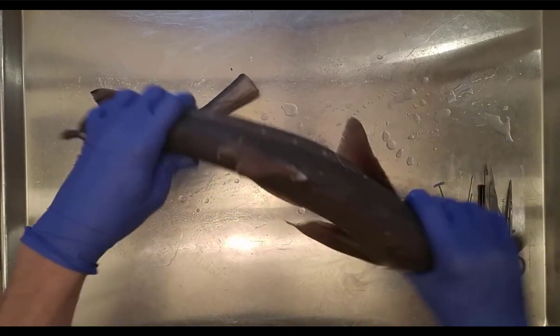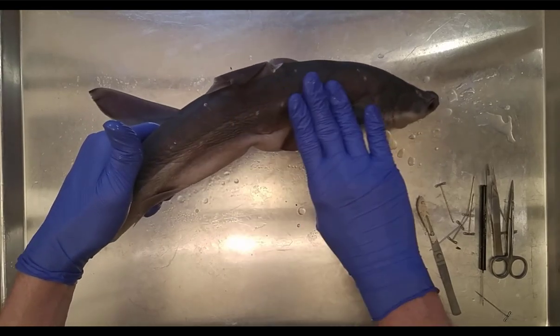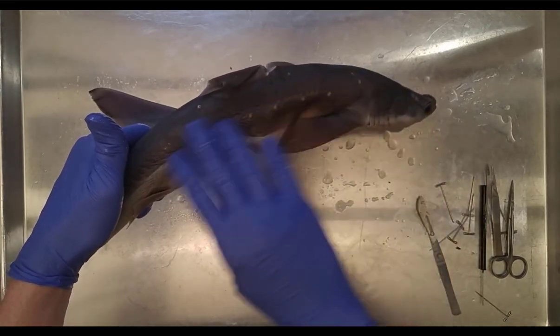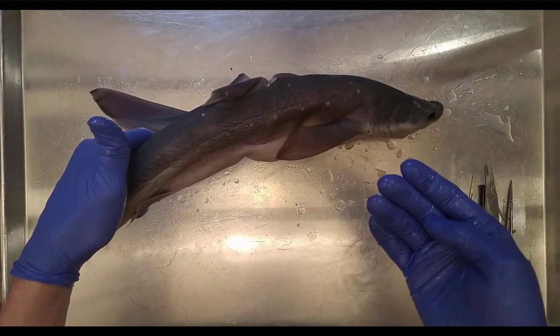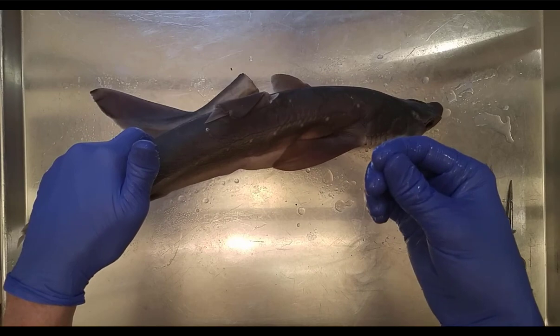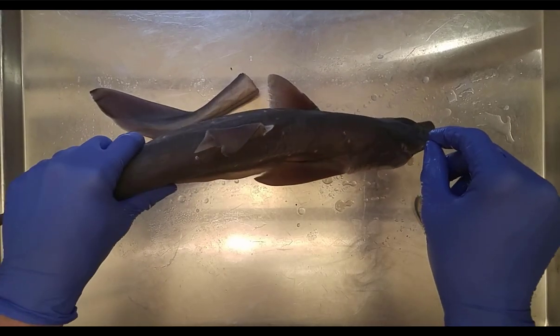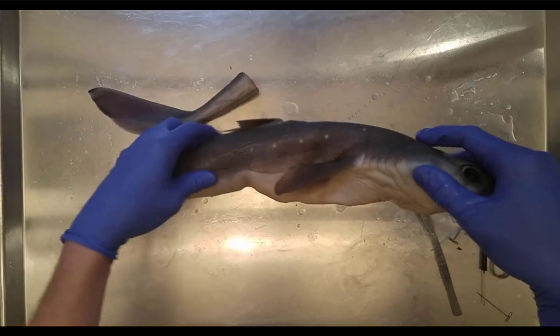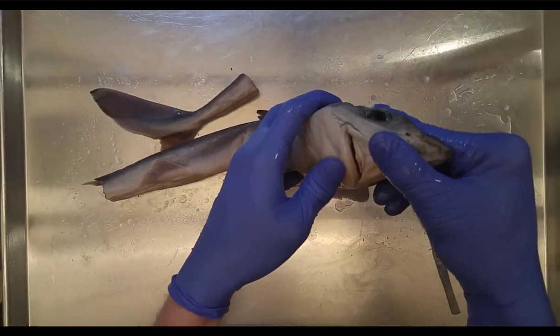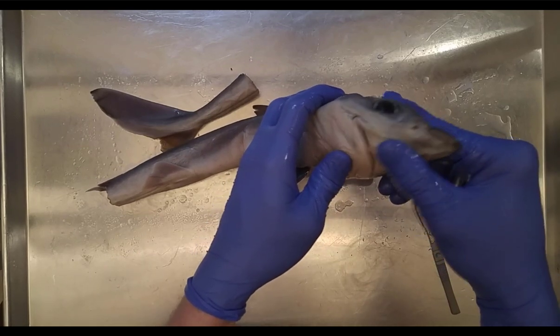There's no bone — it's very flexible, which makes it a good swimmer. If you run your hand across the skin against the grain, it feels like sandpaper because of the placoid scales, which are made of dentine from the dermis and enamel from the epidermis — the same material as your teeth. In fact, shark teeth are modified placoid scales.